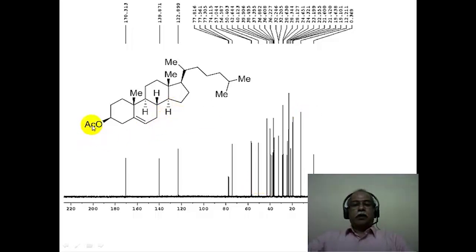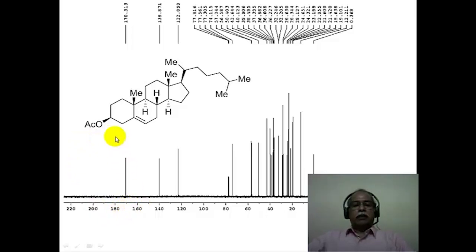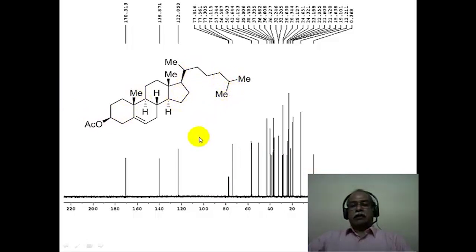Cholesterol acetate is a steroidal molecule with about 29 carbons including the acetyl carbon. Counting the signals in its carbon-13 spectrum reveals approximately 27–29 peaks for this aliphatic compound. The most deshielded carbon is the carbonyl carbon of the acetate group at around 170 ppm, readily identified. Two olefinic carbons appear in the olefinic region, with the more substituted olefinic carbon at higher delta and the less substituted at lower delta. The CDCl₃ three-line pattern is also visible, and the remainder of the signals correspond to the aliphatic steroidal skeleton.